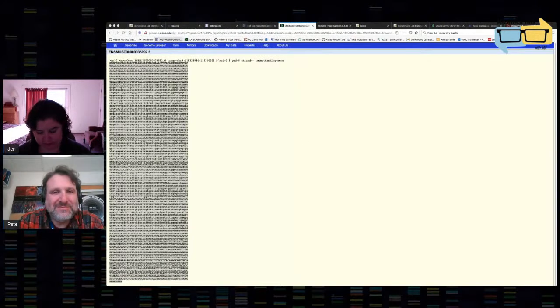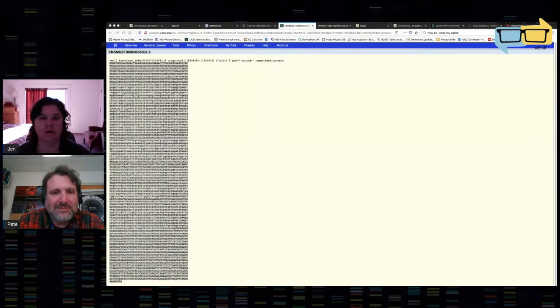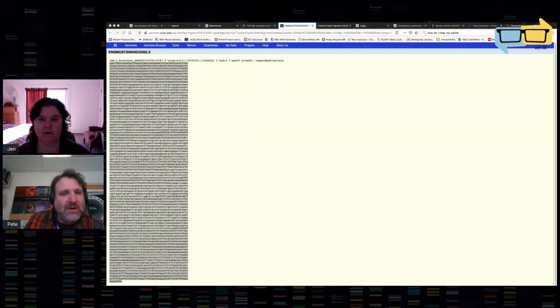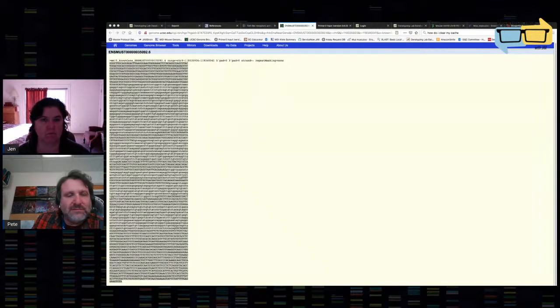I'm going to paste my sequence here and blow it up nice and big so you can see it. Can you see the sequence pretty well, Pete? I'm not seeing it in Gene Construction Kit yet — I'm still seeing the UCSC browser. I have it in Gene Construction Kit.